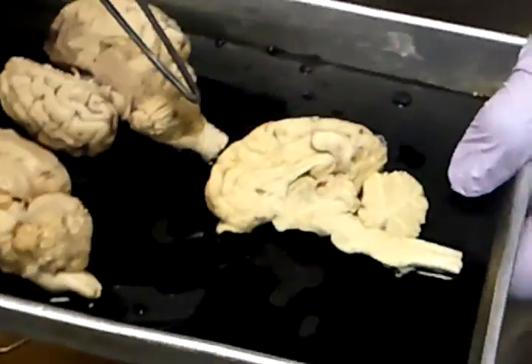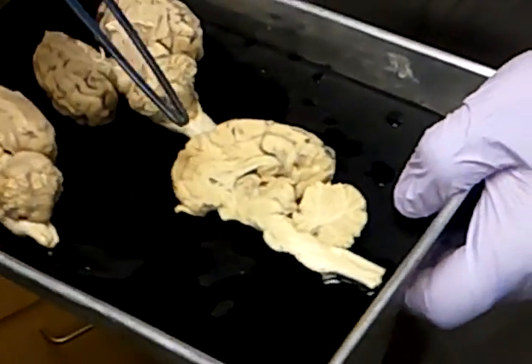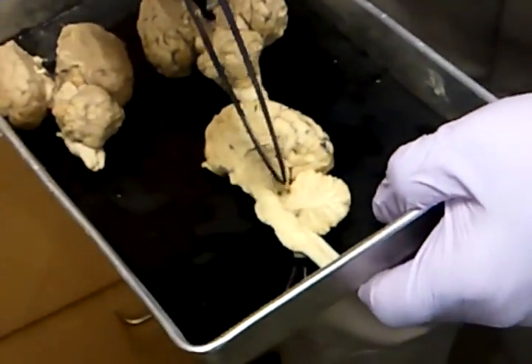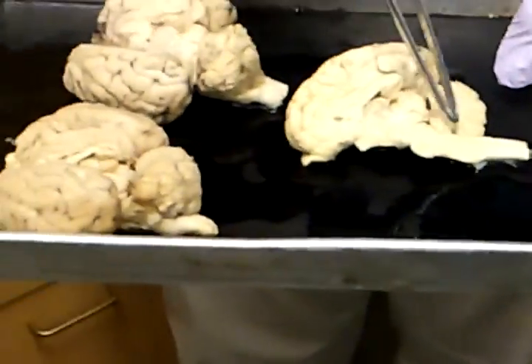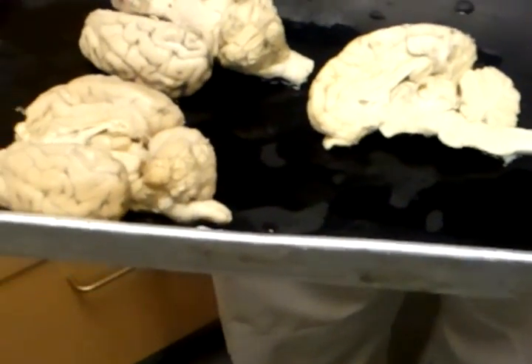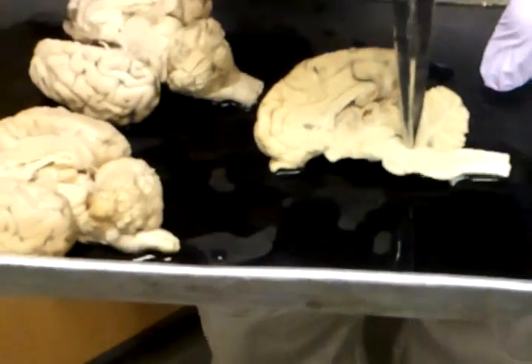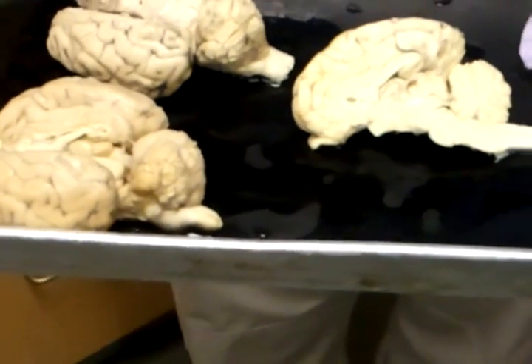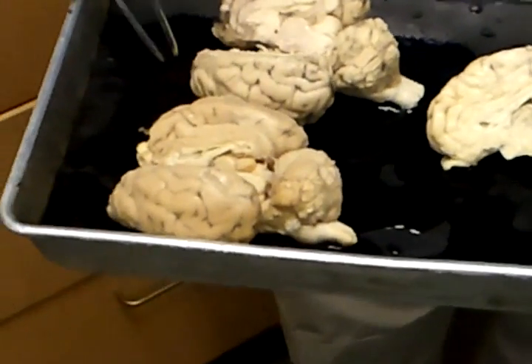Quadrigemina. Yeah, corpora quadrigemina. And there they are. There's the superior and the inferior colliculus. You see them right there. Okay. What's this sitting off the back here? Cerebellum. What's the white matter in the cerebellum called? Arbor vitae. I've got a space right below the cerebellum. What's that space? Fourth ventricle.